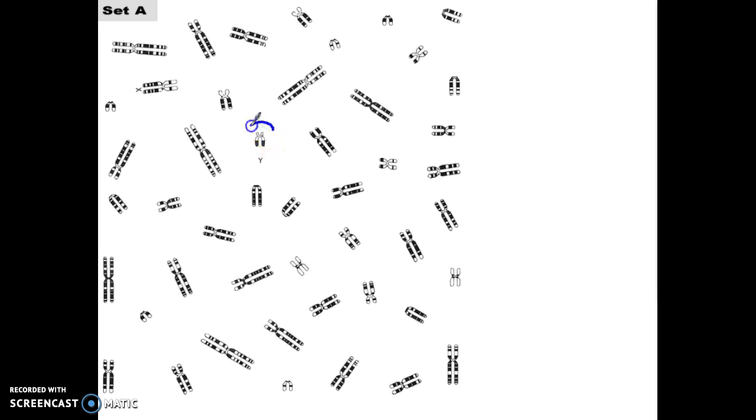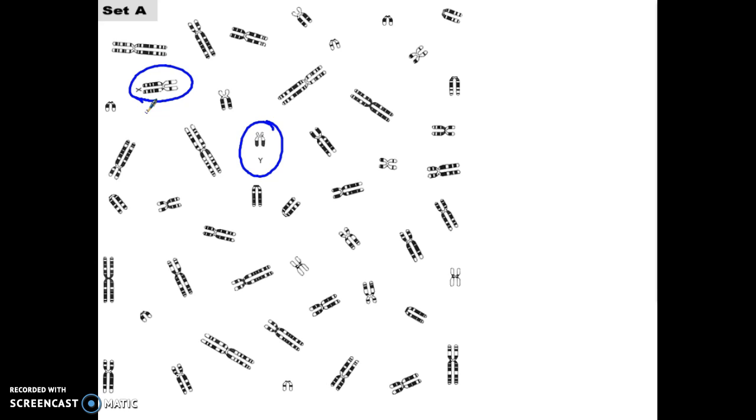So let's find one of them. For example, this chromosome has a Y underneath of it, and this chromosome over here has an X underneath it. Because of the detail that's given, we have to identify these are the sex chromosomes. In these pictures, only one sex chromosome of each variation might be identified.